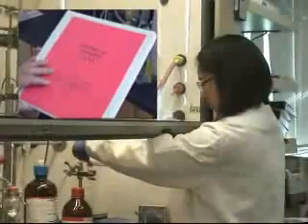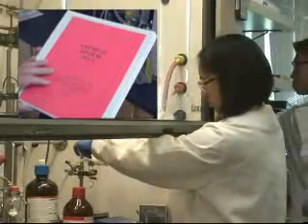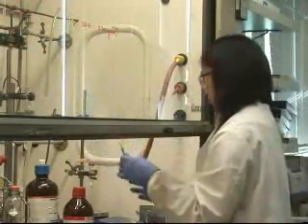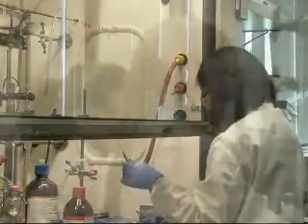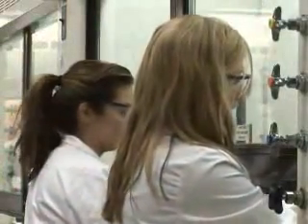The purpose of a chemical hygiene plan, CHP, is to outline laboratory work practices and procedures that are necessary to ensure that members of the university community are protected from health hazards associated with chemicals in your laboratory environment.